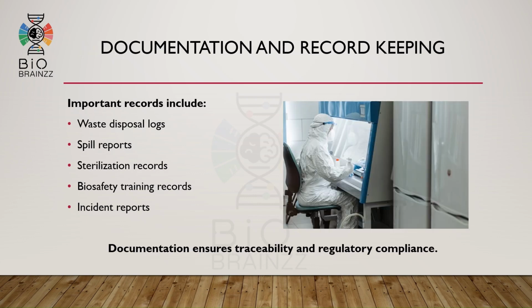Proper documentation and record keeping are essential in laboratory waste management and biosafety systems. Important records include waste disposal logs, spill reports, sterilization records, biosafety training records, and incident reports. Documentation ensures traceability, accountability, and regulatory compliance.